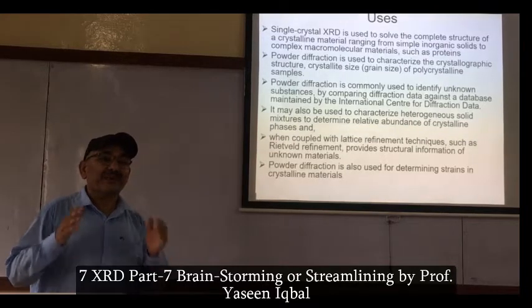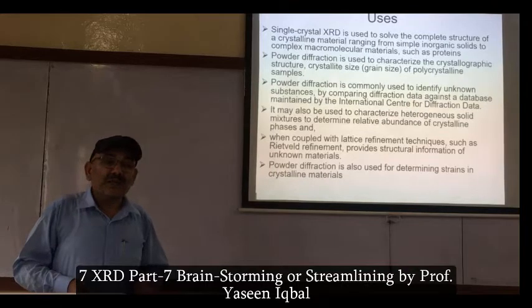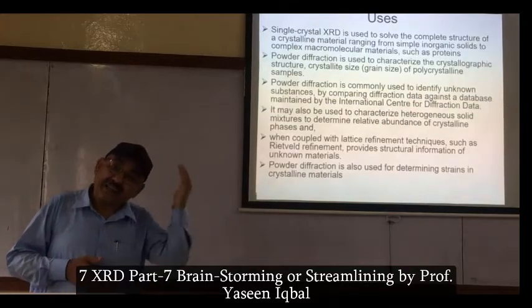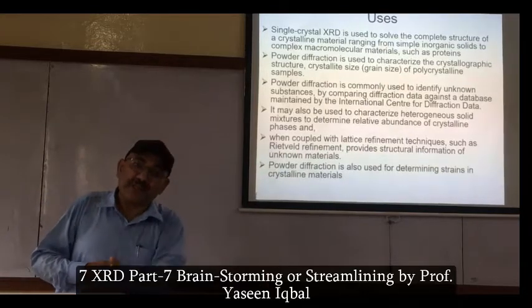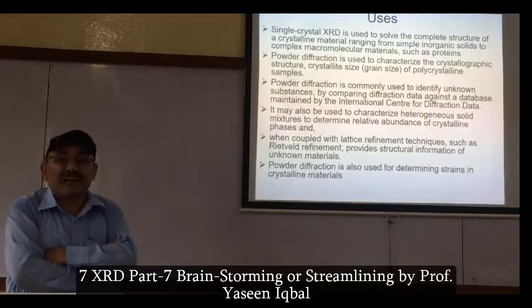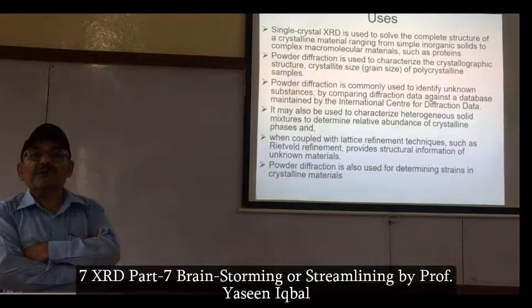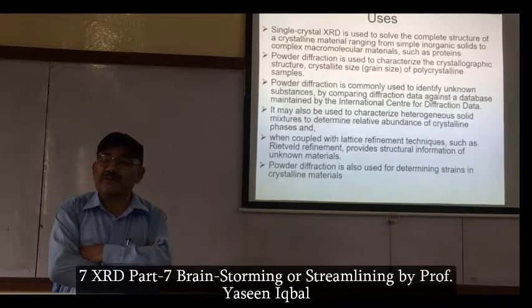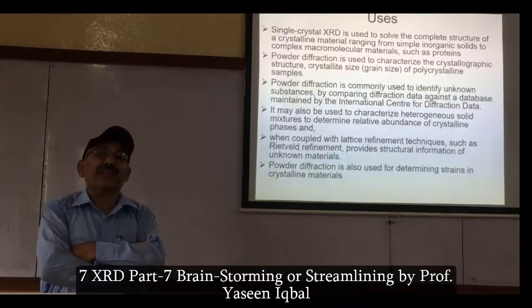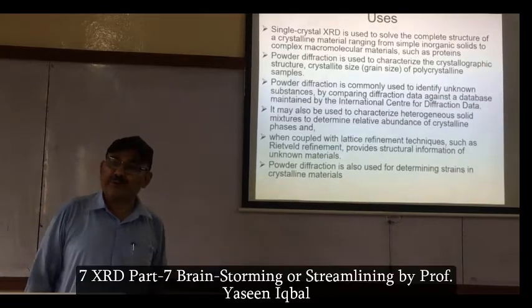You are doing phase analysis with X-ray. You are identifying different phases within the sample, and then the phase tells you about the substance, right? Technically you are doing phase analysis, and when you know about different phases inside the material, then obviously phases have certain chemistry and you know about them.